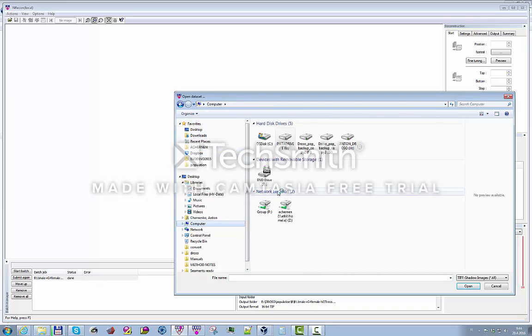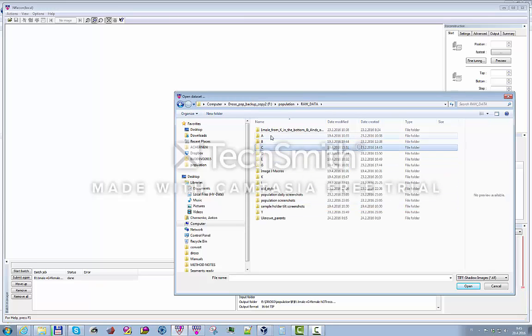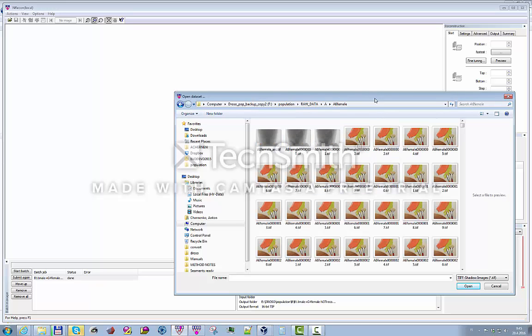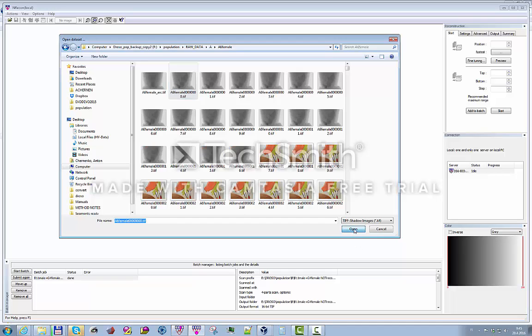As we discussed in the overview tutorial, we have the same data on the data drive on this desktop. There's a backup, copy 2 and copy 3, all identical. Let's just open some data from here. So raw data, let it be, for example, A6 female. Okay, so this is the data set, and we can click on any file, let's say this one, and click open.